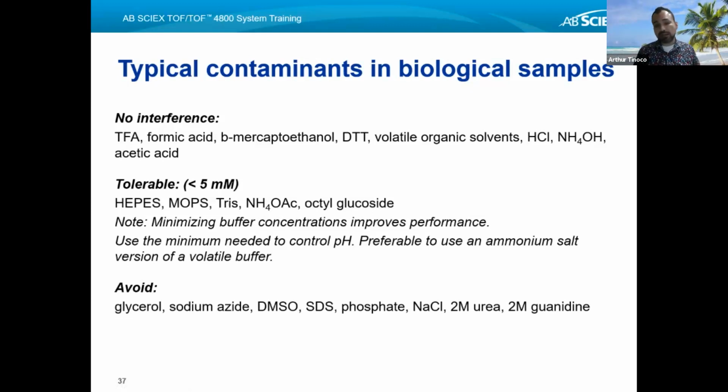The instrument will simply not collect good data with DMSO present, nor will you be able to crystallize your sample in that. Also avoid SDS, phosphate, sodium chloride, 2 molar urea, and 2 molar guanidine. These are things you need to avoid.